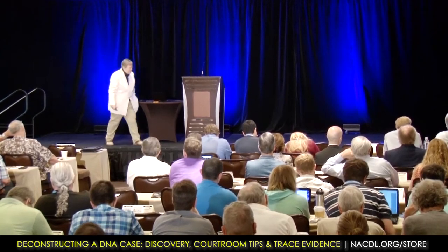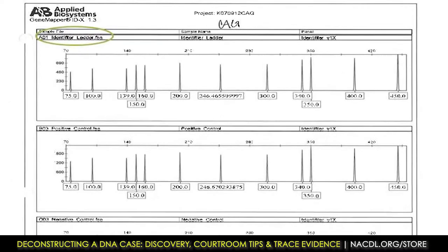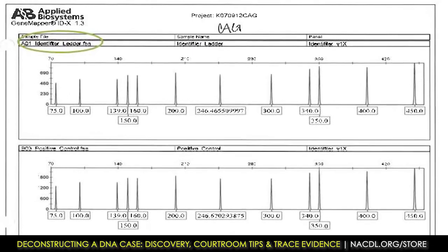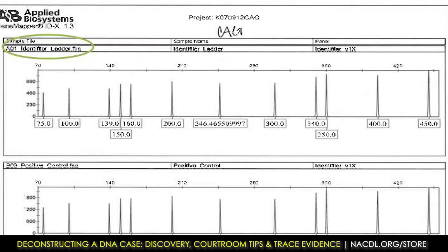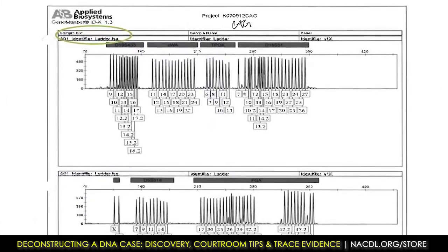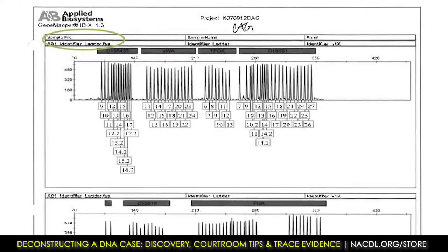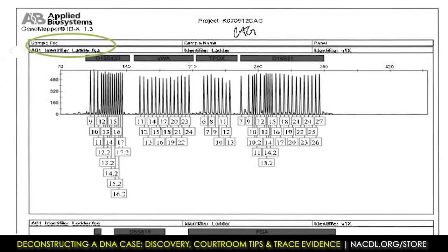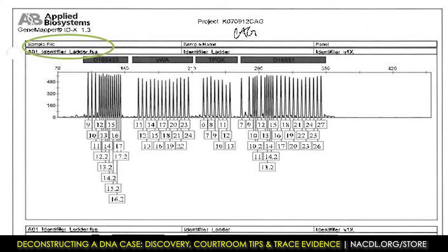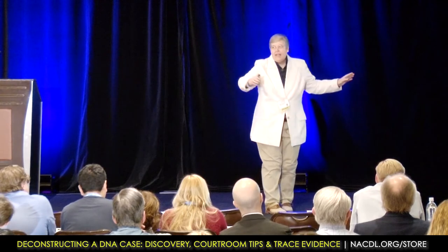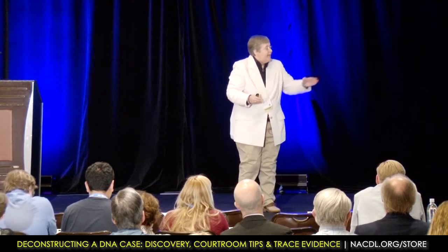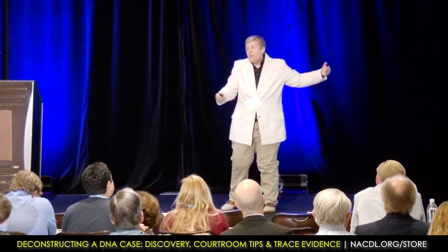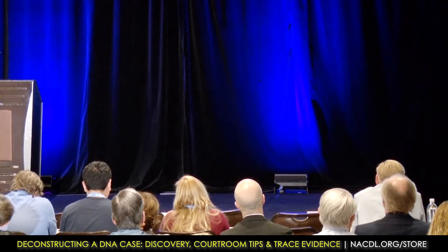Let's go to some electropherograms. This is just a very simple electropherogram—you should have one of these in every case. This is a ladder. If they don't give you a ladder, there's a problem. You always want a ladder, a positive control, and a negative control. A ladder is simply what the company that produces the kits makes so we know what the possible alleles are for any one location or locus. We do this for every run to make sure that all the alleles at all of the loci are coming up correctly. If there's a deviation, it will be called OL—an off-ladder allele—meaning there is a peak that does not fall in the ladder range, which could be a problem.